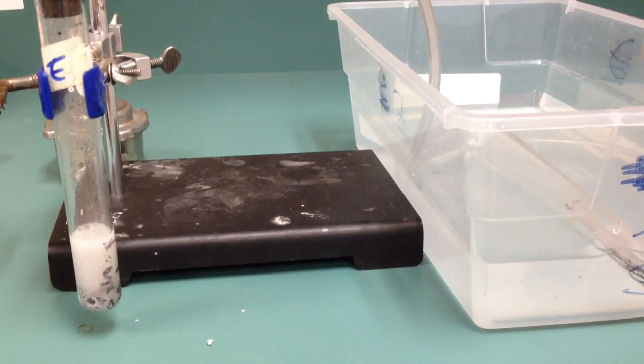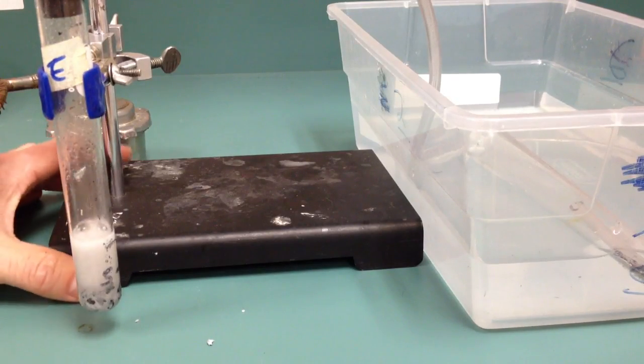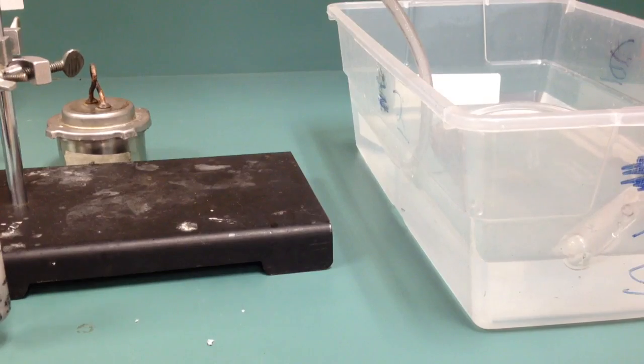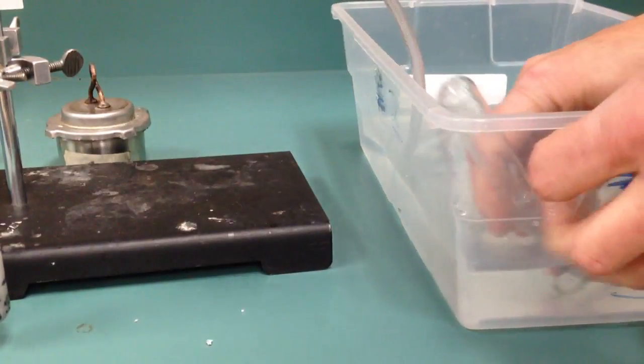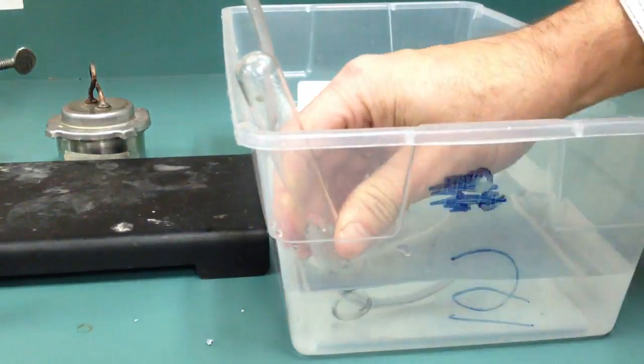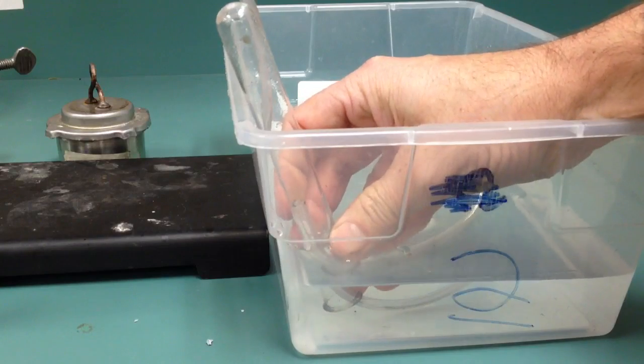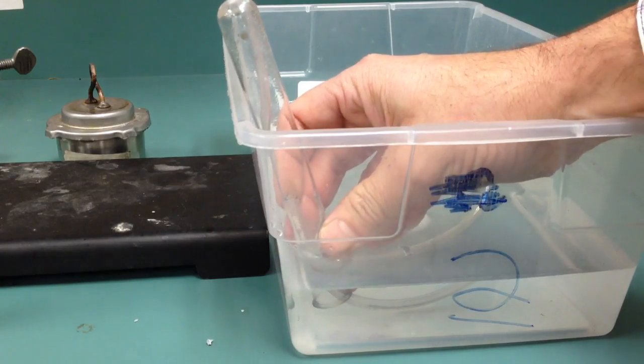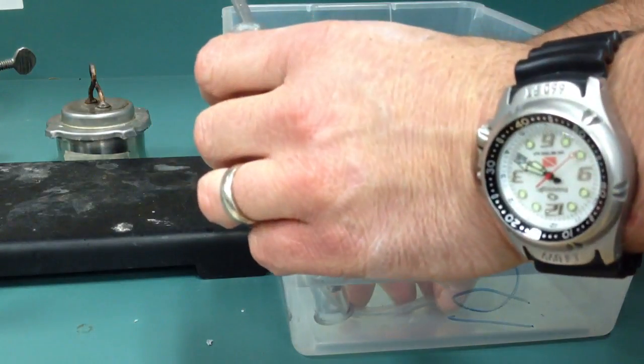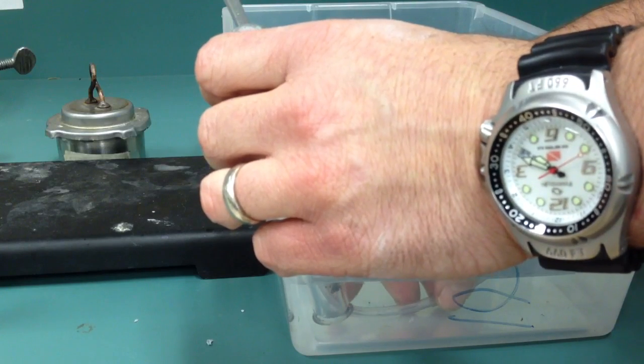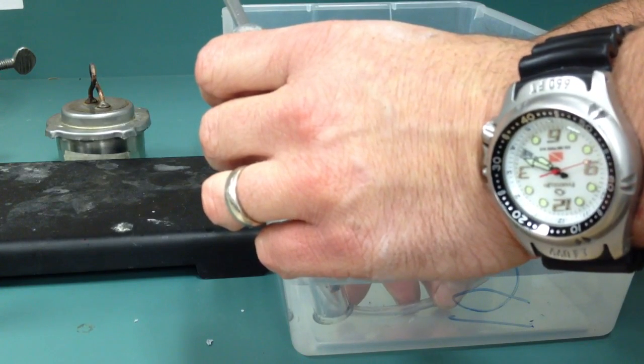So, that's collecting hydrogen gas. So, the next part of this reaction, I'm going to move this even further over, like this. Should be getting some hydrogen gas there. So, let's see if I can do this. I'm going to try to react the hydrogen gas with oxygen in the air. It doesn't react by itself. You need a little push. And the push can just be a little quick flame or heat.